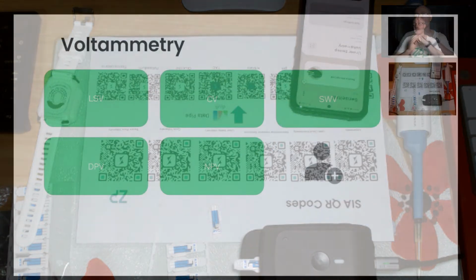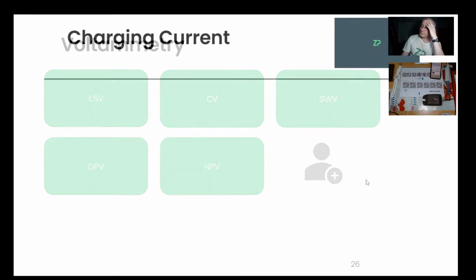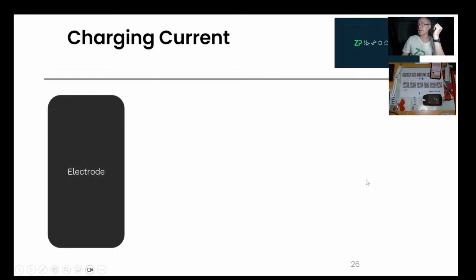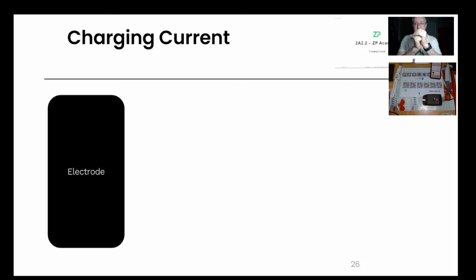So you had a very specific question, which is: talk to me about differential pulse voltammetry. So let's talk about differential pulse voltammetry. First of all, there's a bit of a lineage here. Why do differential pulse voltammetry and square wave voltammetry in particular exist?